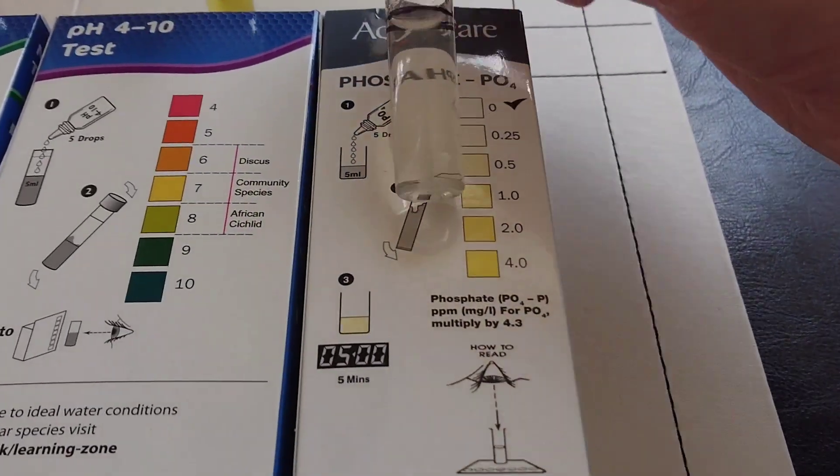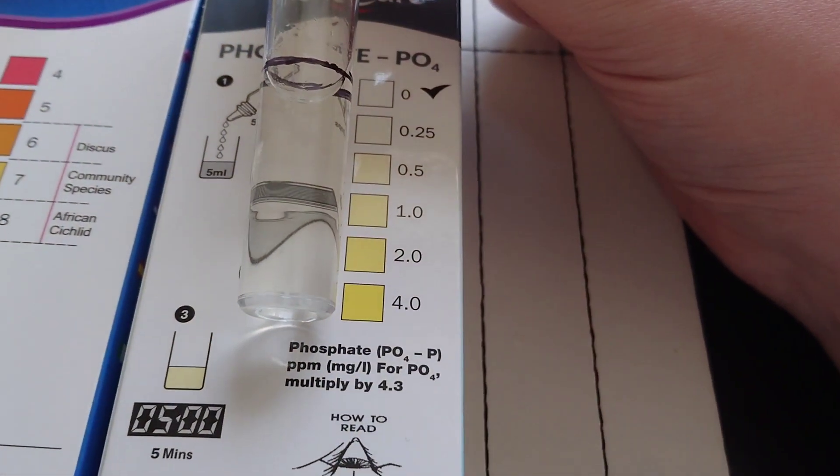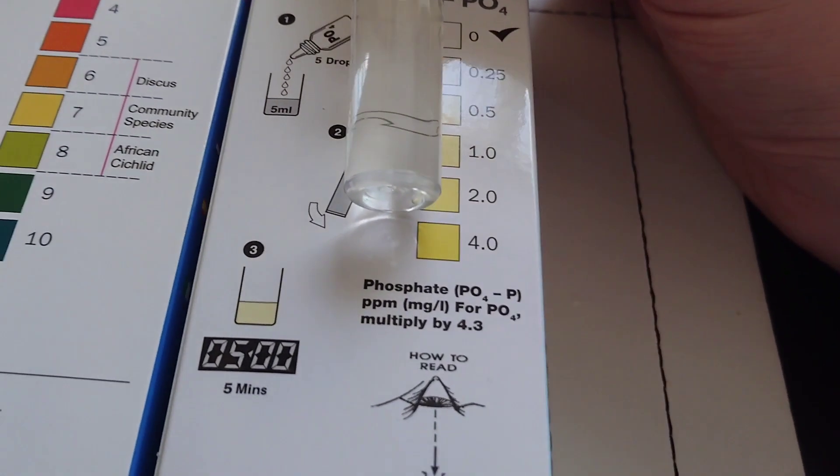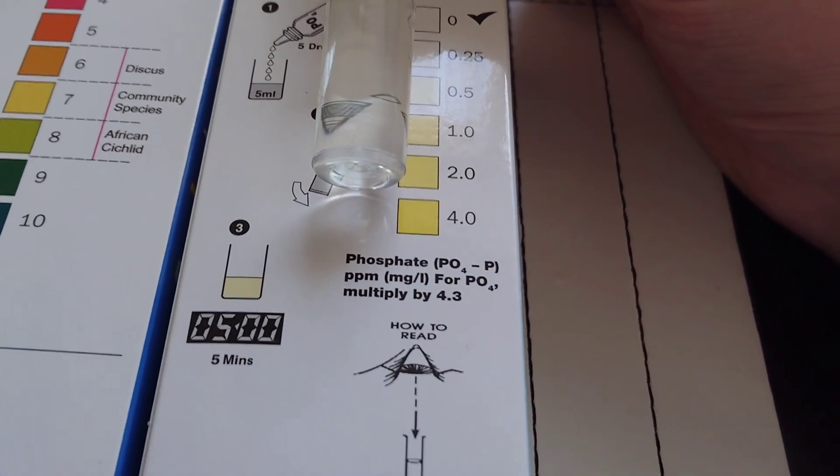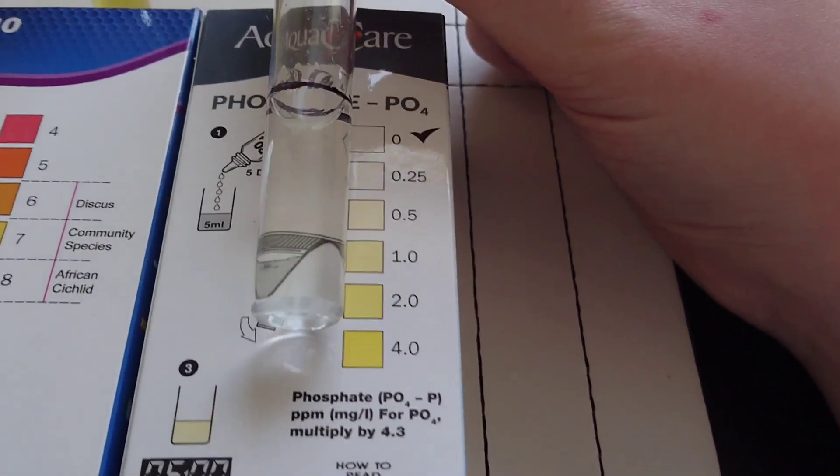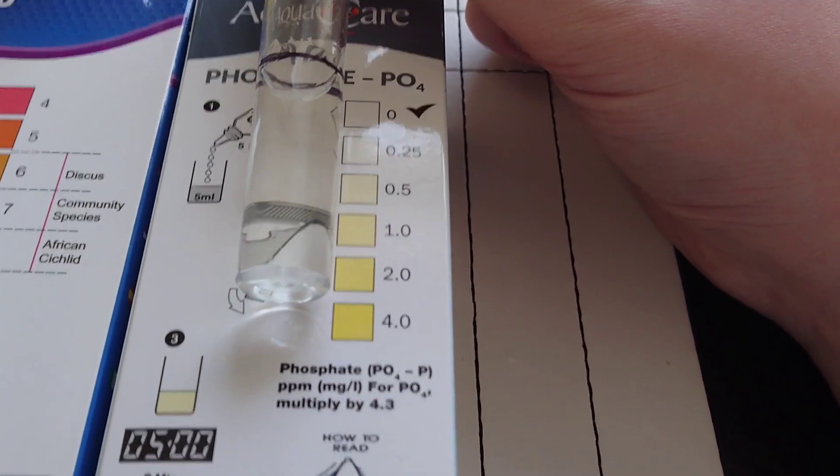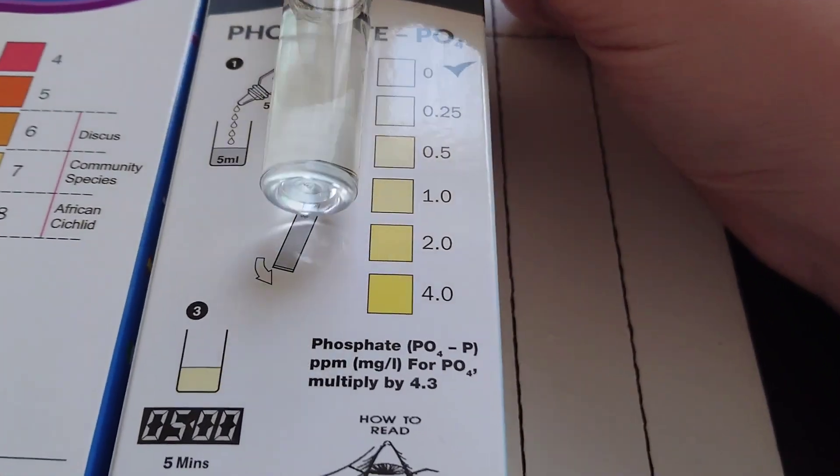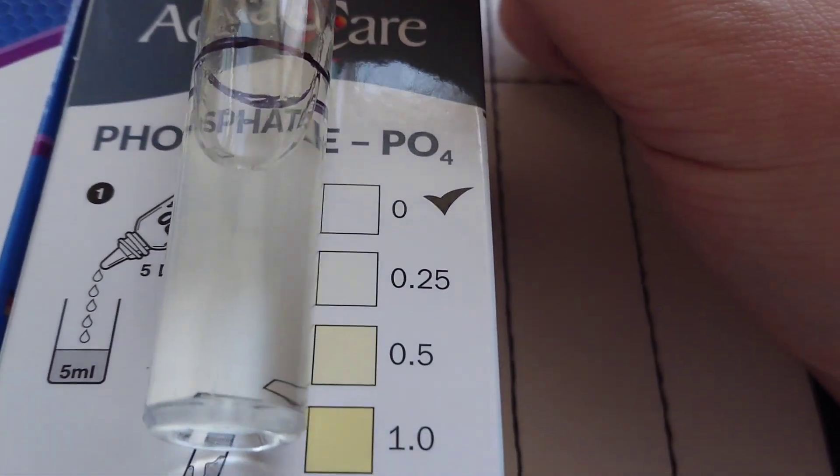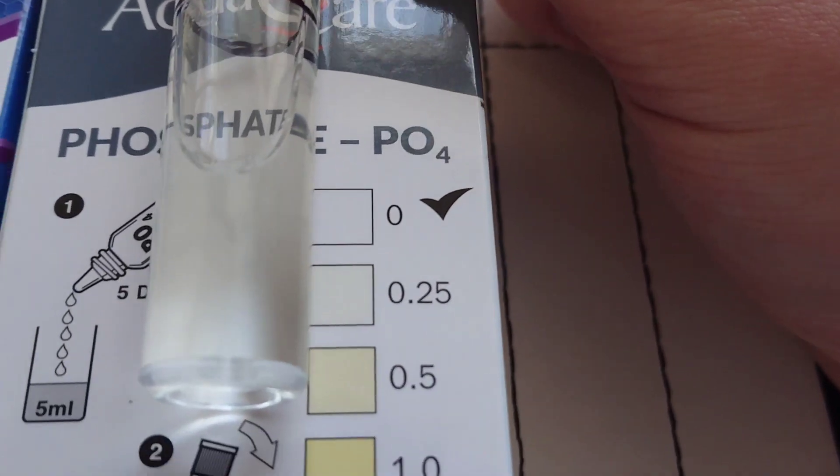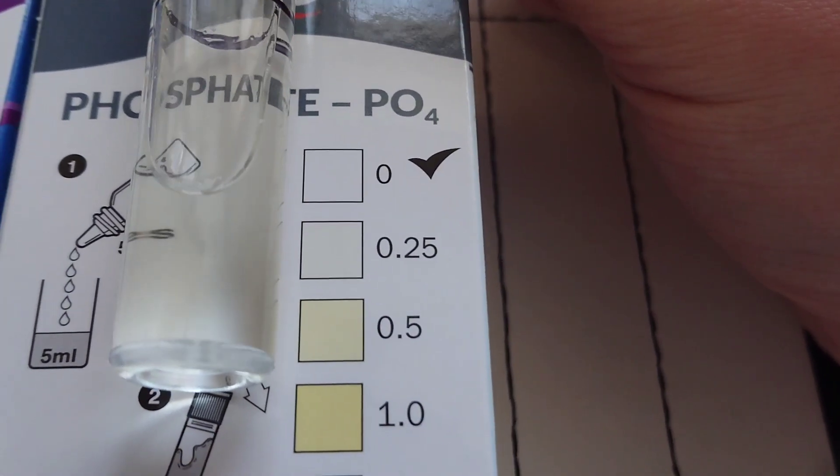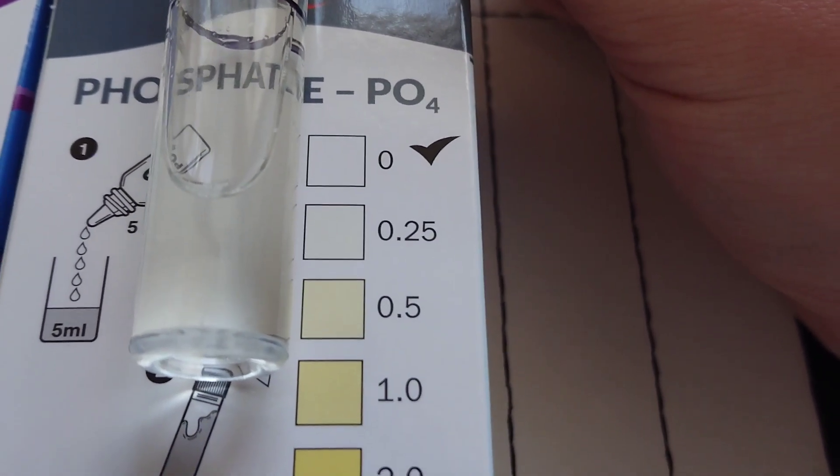And then phosphate. Phosphate's not really a big deal in a freshwater tank. All it'll do really is give algae more food to eat. But we have very low, I'd call that zero or maybe 0.25 at the most.